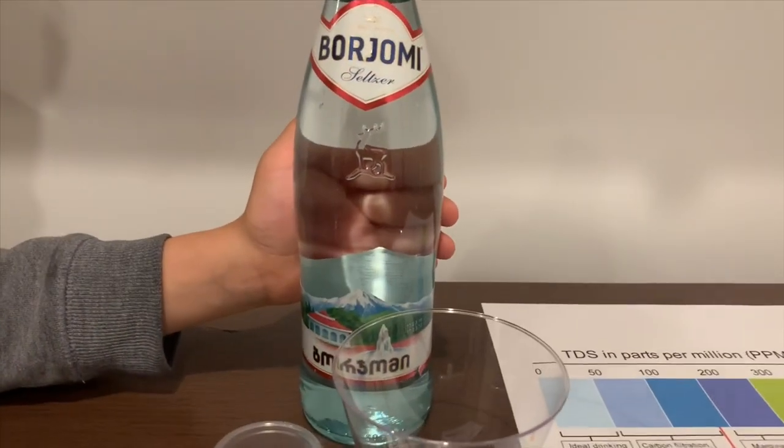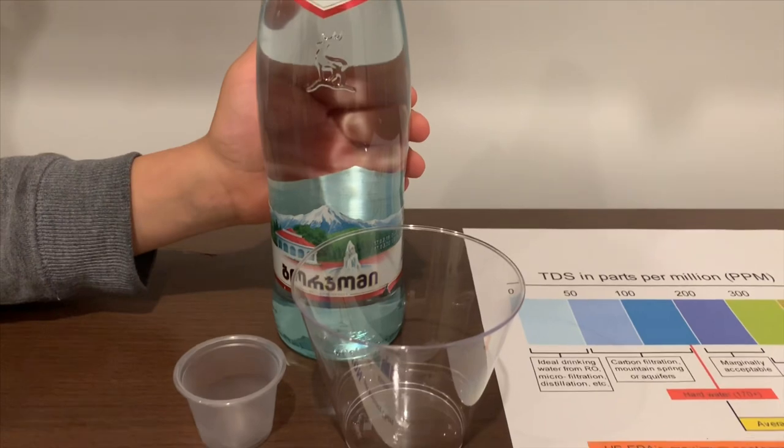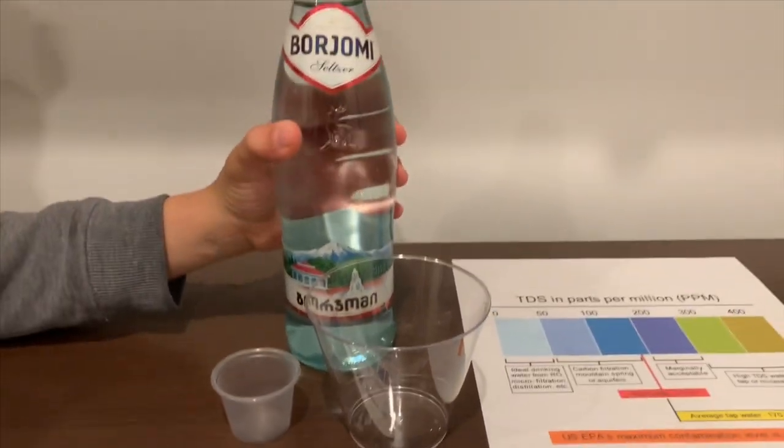This is Borjomi natural mineral water. It's sourced from Georgia and it costs $1.99. Let's test the pH and TDS levels.